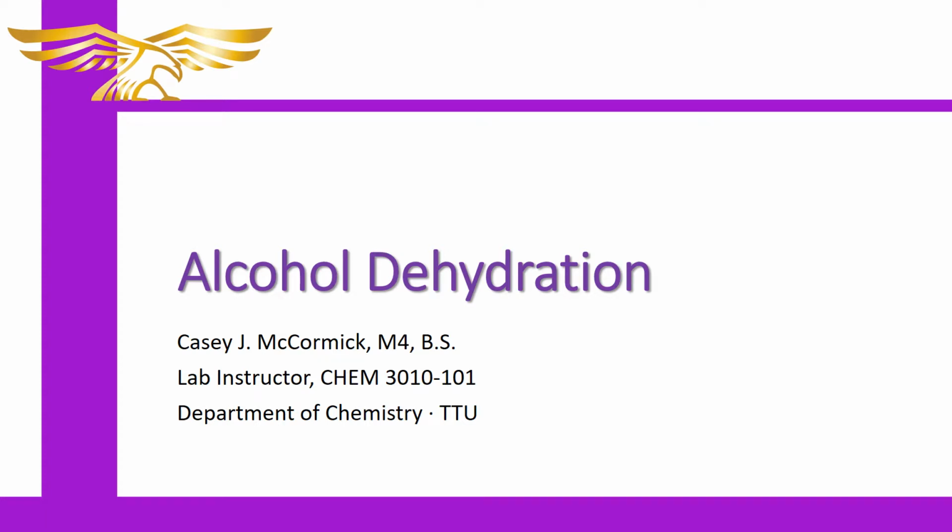And this is the pre-lab webinar about alcohol dehydration. We'll run through this pretty quickly. It's a fairly easy reaction. It's going to demonstrate the E1 mechanism, which we haven't talked about yet, and it follows in conjunction with this series of lectures that we've had on nucleophilic substitution as we move through the different kinds of substitution and elimination reactions that go from SN1, SN2, E1 to E2, and then how we all correlate that together. Again, this will specifically focus on the E1 mechanism.